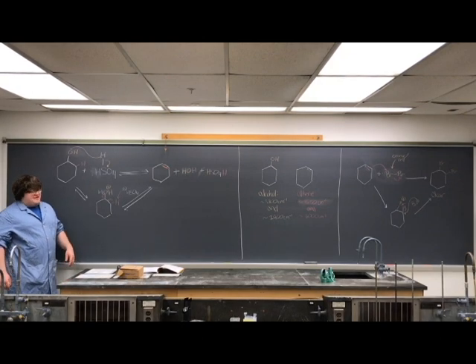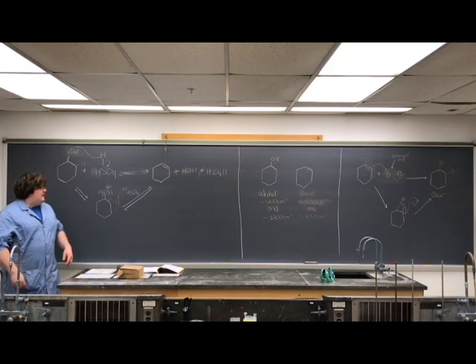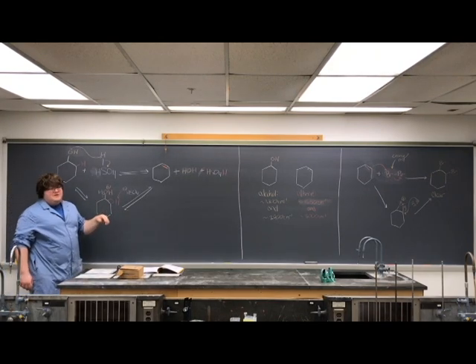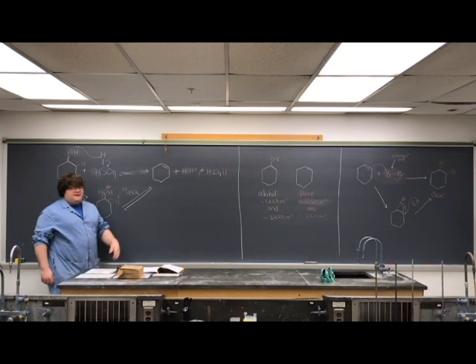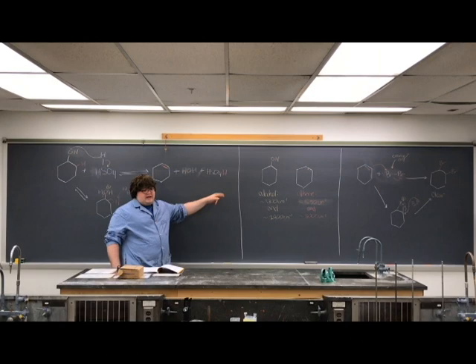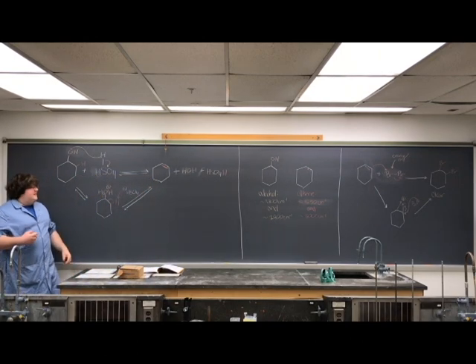Alright guys, so today we are going to be doing acid catalyzed dehydration of cyclohexanol, which is this species right here. Our acid that we'll be using today is going to be sulfuric acid, which is H2SO4, to form cyclohexene, water, and then regenerate our sulfuric acid. So with respect to sulfuric acid, this reaction is completely catalytic.